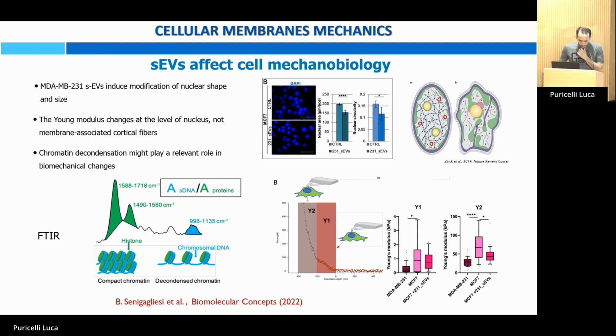And it has also been studied that they, of course, can affect the fate of the cells, as I was introducing before. Our group has been performing mechanical measurements on cells which were receiving extracellular vesicles from breast cancer cells.